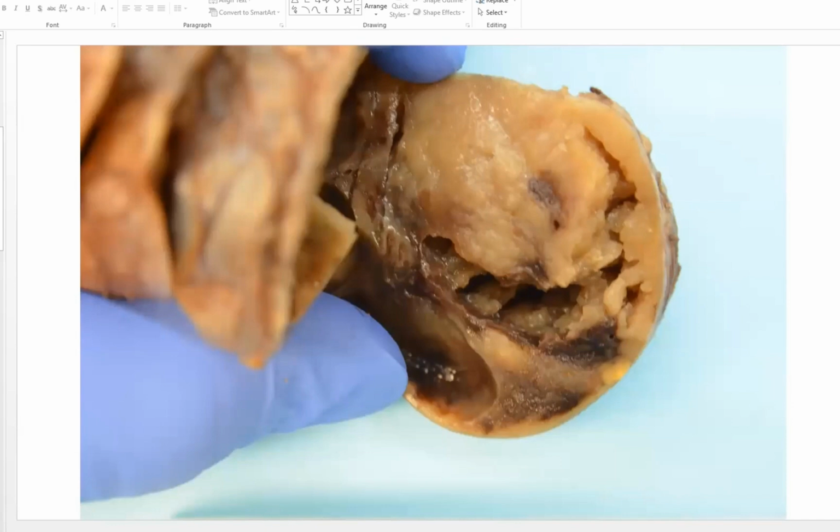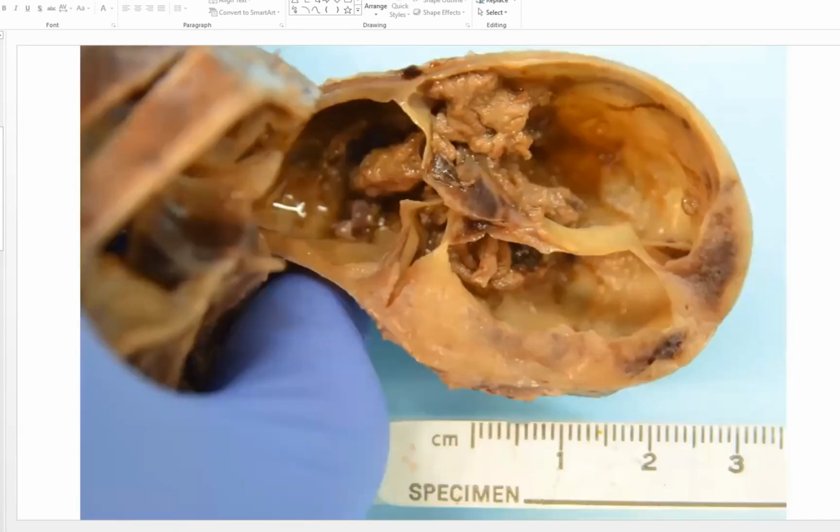Sorry, this is a better picture. And again, just the multicystic nature with all these little projections, which on this picture actually looks like it's probably clot. But nonetheless, again, you want to look at your history, and on grossing, certainly sample this much more focusing on the capsule, if you can go around and capture that.